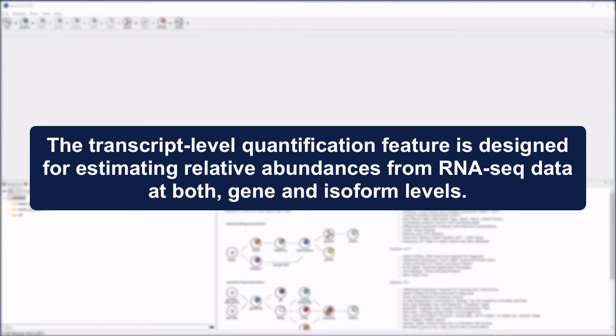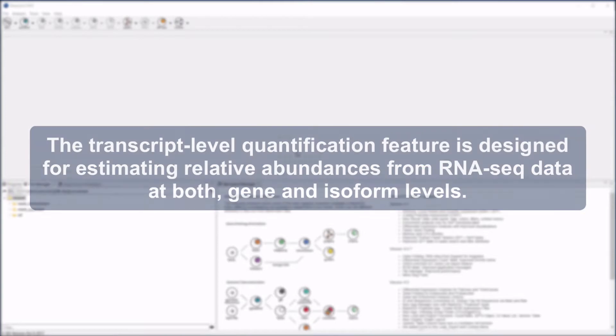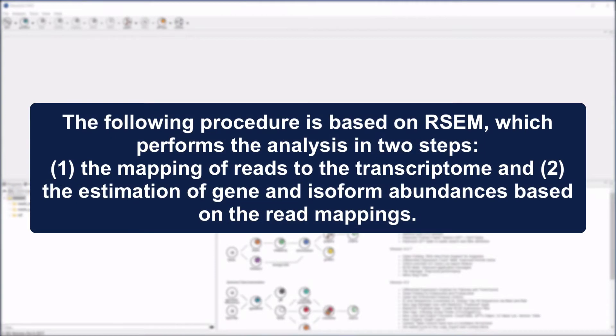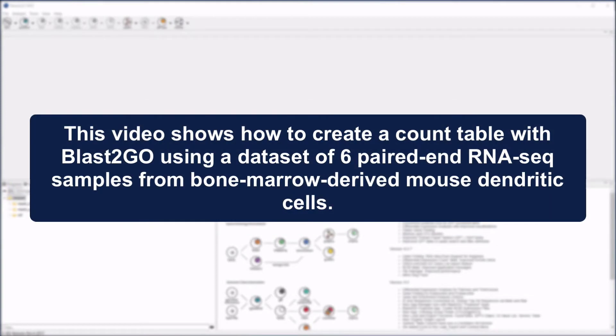Transcript-level quantification feature is designed for estimating relative abundances from RNA-Seq data at both the levels of genes and gene isoforms. The following procedure is based on RSEM, which performs the analysis in two steps: the mapping of reads to the transcriptome and the estimation of gene and isoform abundances based on the read mappings.